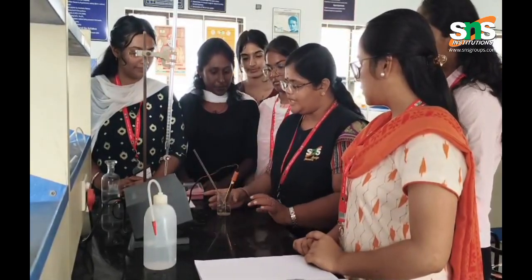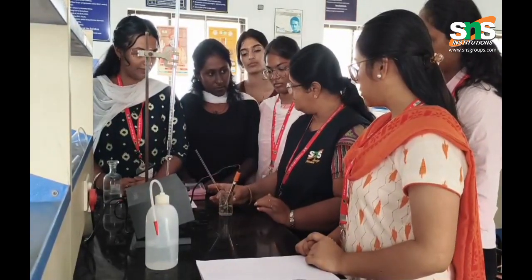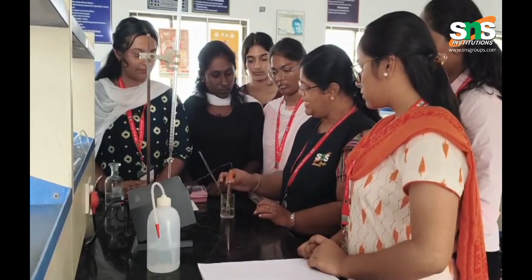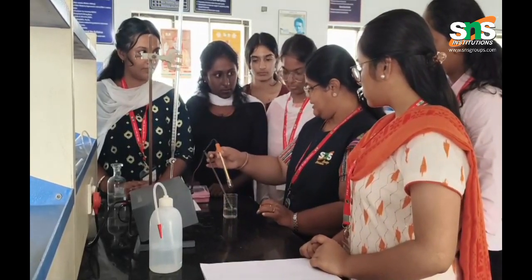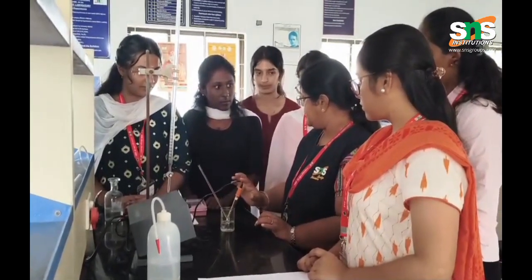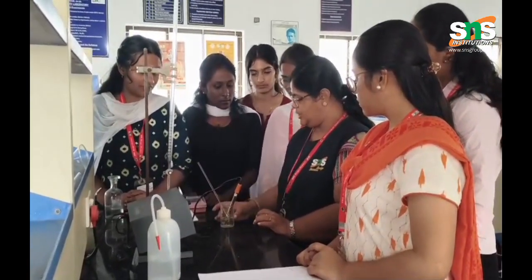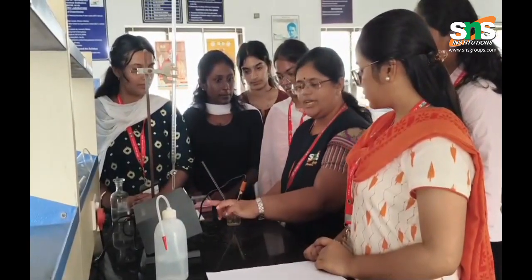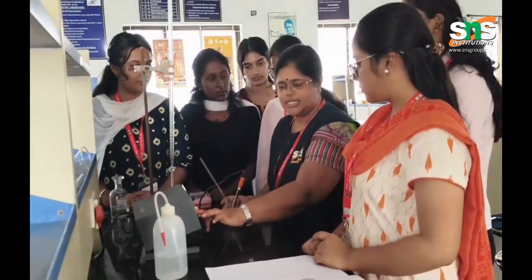Now I have taken 20 ml of the mixture of acid in this beaker and added 20 ml of distilled water. This electrode is dipped into it. This is the conductivity cell. Here a potential difference is developed, and the value in the conductometer is a digital value.